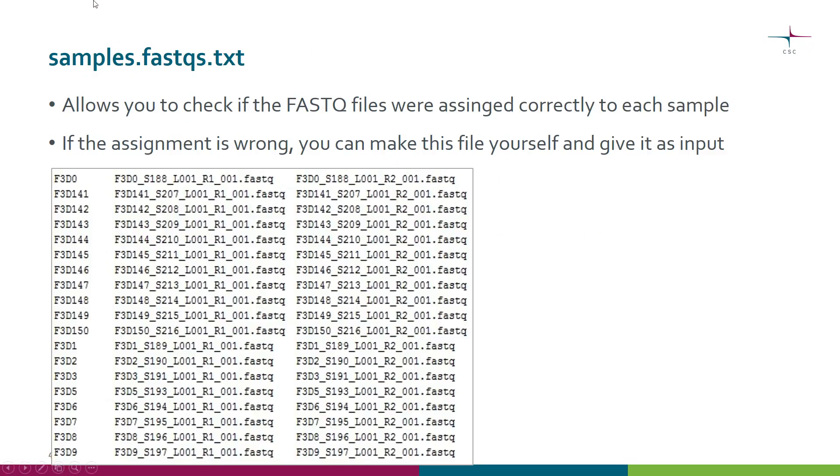First, you get a file called samples.fastqs.txt. This file allows you to check if Mothur did a good job when assigning the FASTQ files to samples.